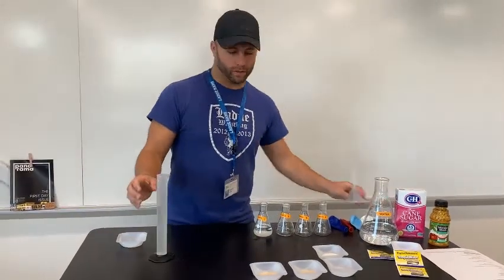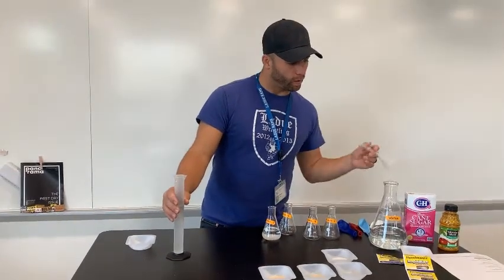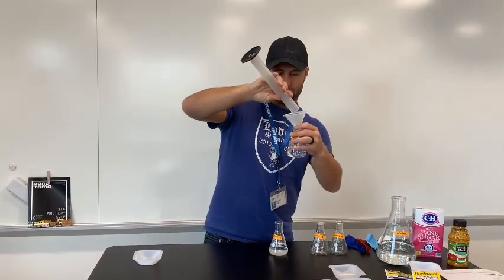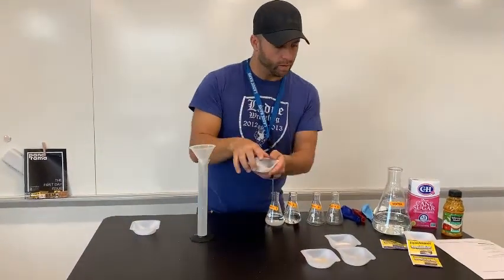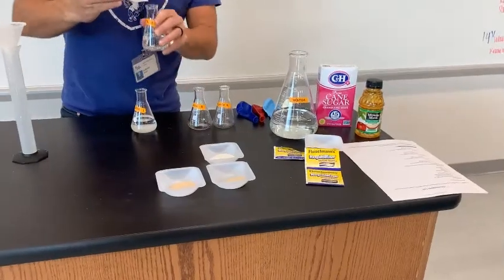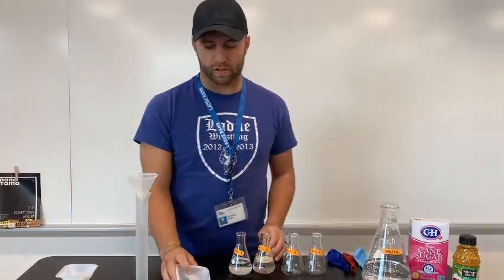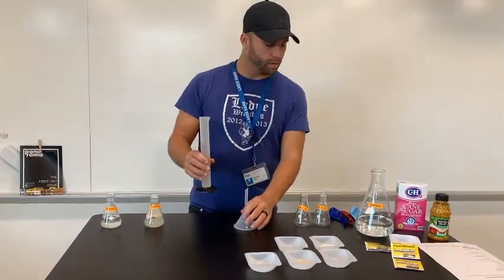For flask two, we will be filling it with 75 milliliters of water and one gram of yeast. We'll go ahead and pour this water in. This is our Fleischmann's Rapid Rise instant yeast. And that is it for flask two.